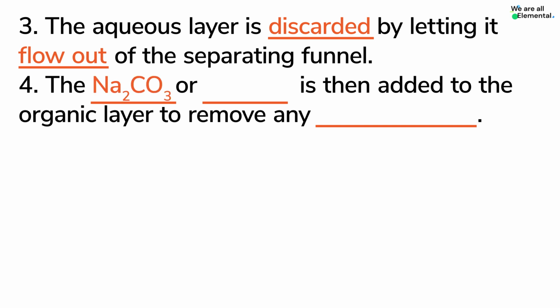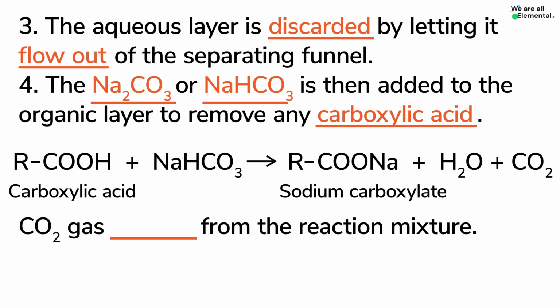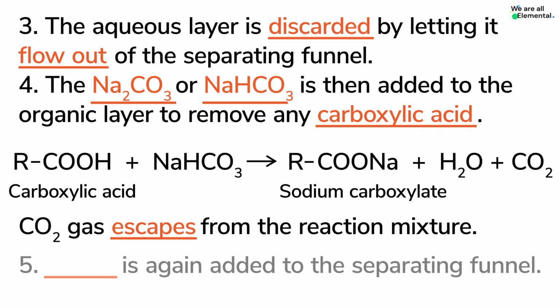Then sodium carbonate or sodium hydrogen carbonate is added to the organic layer to remove any carboxylic acid in it. Carboxylic acids react with carbonates or hydrogen carbonates to form sodium carboxylate, which is water soluble, and the carbon dioxide gas escapes from the reaction mixture.